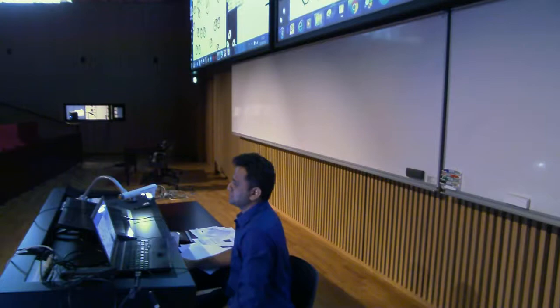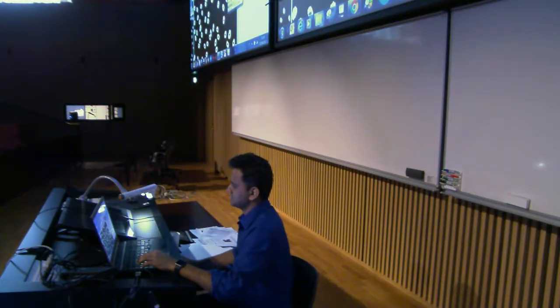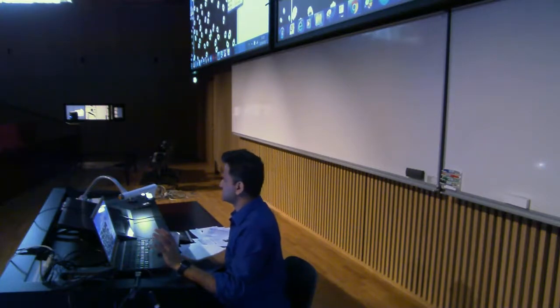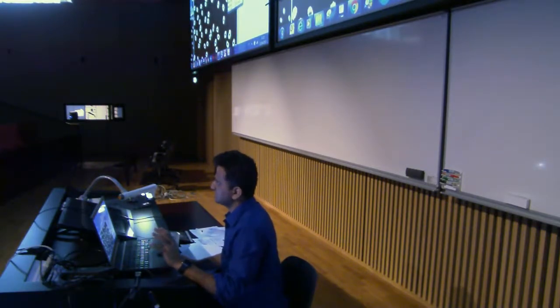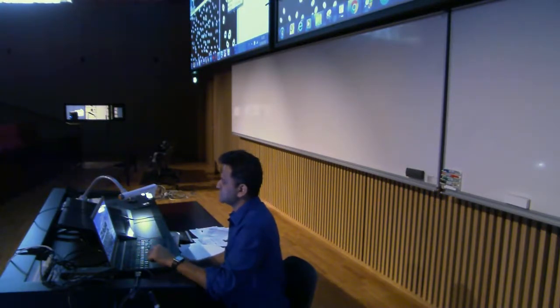And then if you just close this, select this. These are the different regions of interest, by the way. These are different nuclei. You can name them, but of course, if it is nuclei, then you don't want to name them. But imagine that you have just 2-3 segmentation objects in your interest. Then you can actually rename them individually. You can name them accordingly.